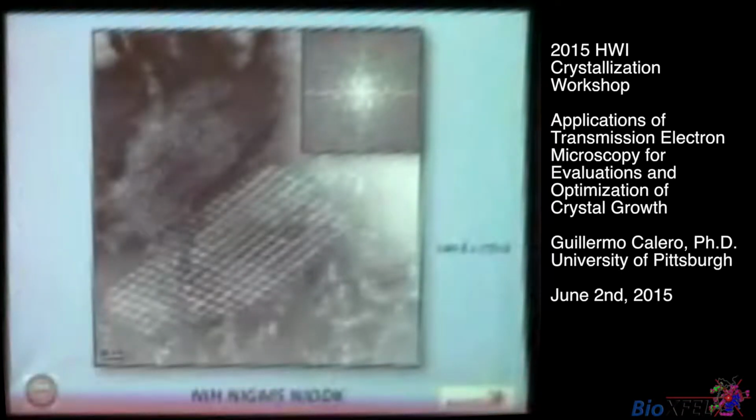Right. Here's another example. You can see in this case the large polymerase particles individually, and you can also see all sorts of things. Here you see some probably aggregates of little crystals, and then you have this crystal here. This is 50 nanometers.